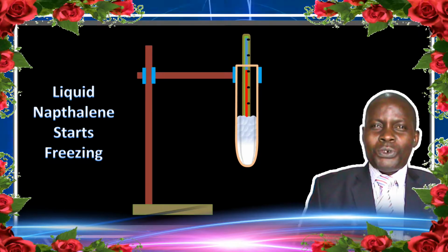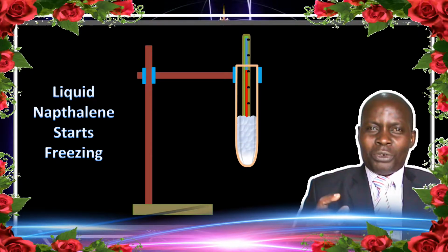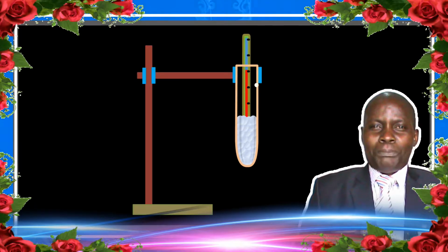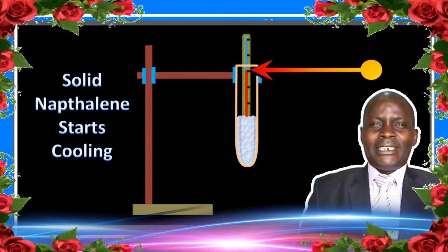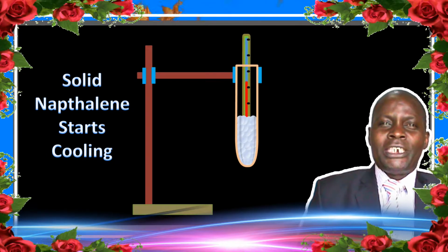The temperature will remain constant from the time it starts changing from liquid until all of it changes to solid. Then it starts cooling down in the solid state.